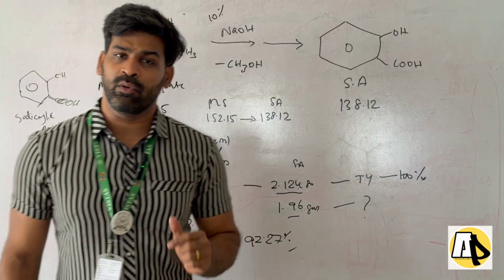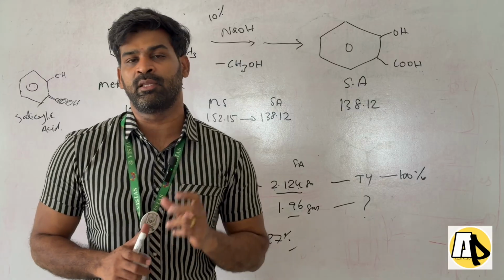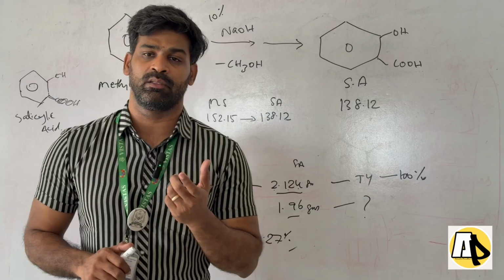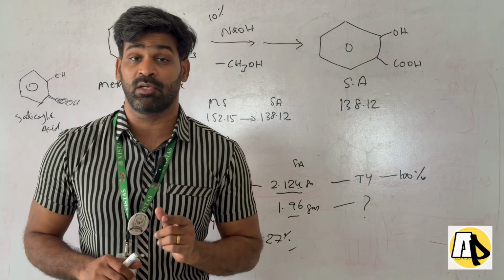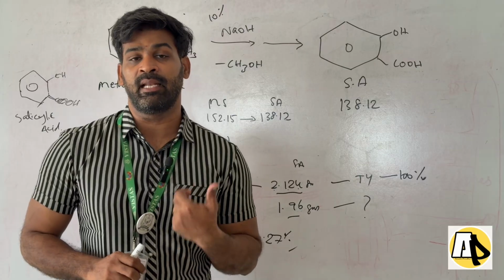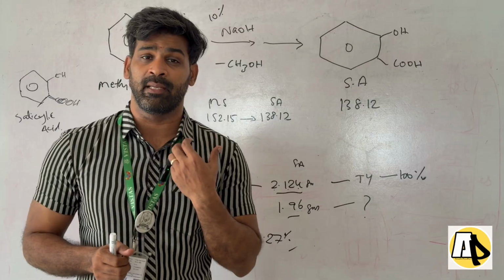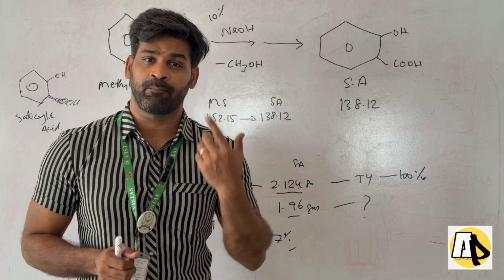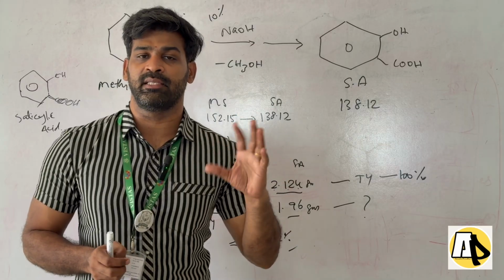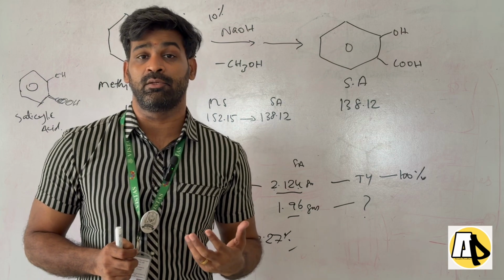And there are a few important points that we need to keep in mind while doing this procedure. The byproduct generated from the practical procedure was methanol. As I told you, you must be very careful while inhaling the methanol. You might have to use a mask, because inhaling methanol will result in blindness. It goes into the liver, where it metabolizes and converts into formaldehyde.